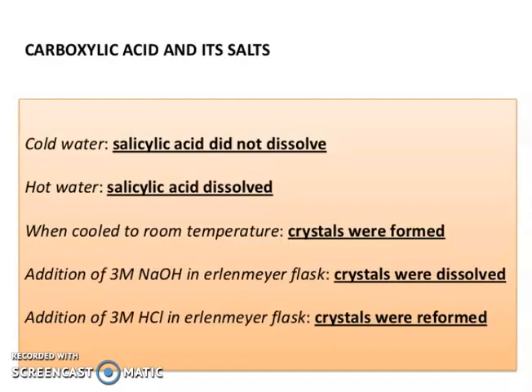Now, carboxylic acid and its salt. Cold water, salicylic acid did not dissolve. Hot water, salicylic acid dissolved. When cooled to room temperature, crystals were formed. Addition of 3M sodium hydroxide in Erlenmeyer flask, crystals were dissolved. Addition of 3M hydrochloric acid in Erlenmeyer flask, crystals were formed.